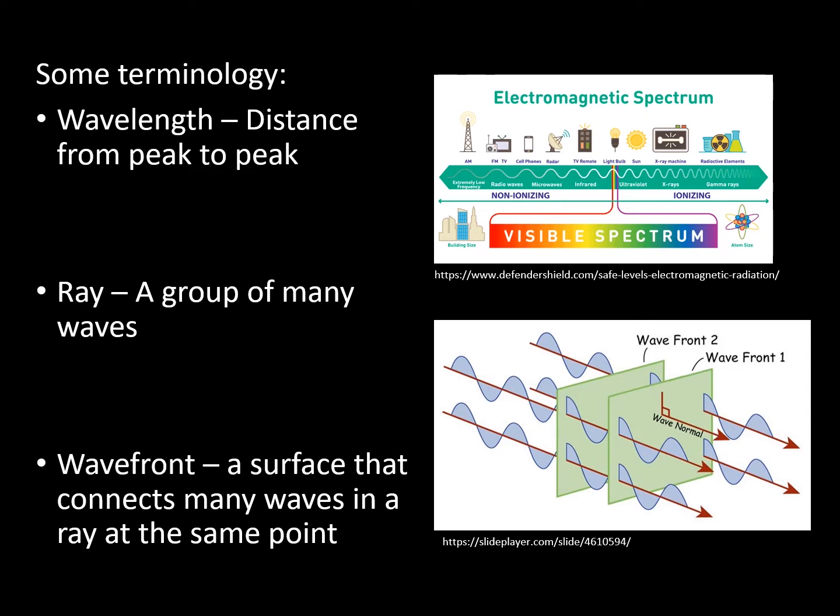And in the previous slide, I referred to light as electromagnetic radiation, and depending on the length of the waves is the type of light we have. So visible light is in this very small area here. And this gives us all our colors. So the longer wavelength is red, and then the shorter wavelength is purple. But this is only a small part of that electromagnetic spectrum.